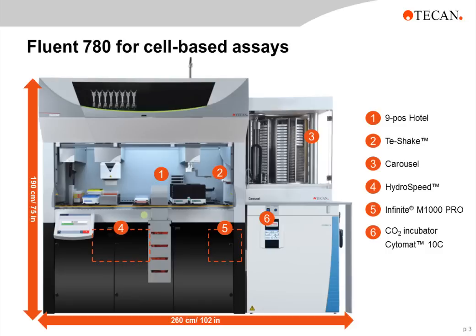For example, labeled with number 3, the TCAN carousel that has a huge capacity for different labwares. You can store microtiter plates and disposable tips. Below the carousel, you see an incubator integrated. This is the latest generation of the Cytomat from Thermo.